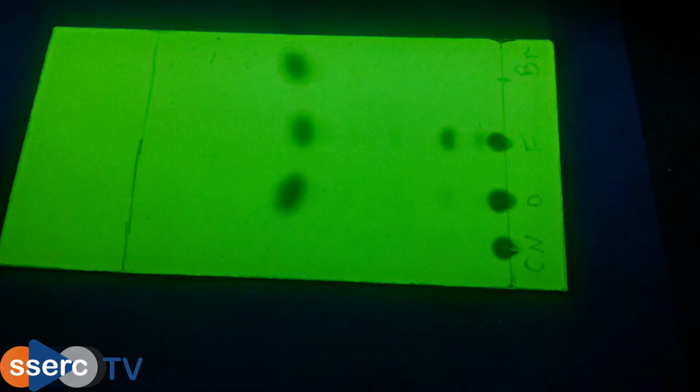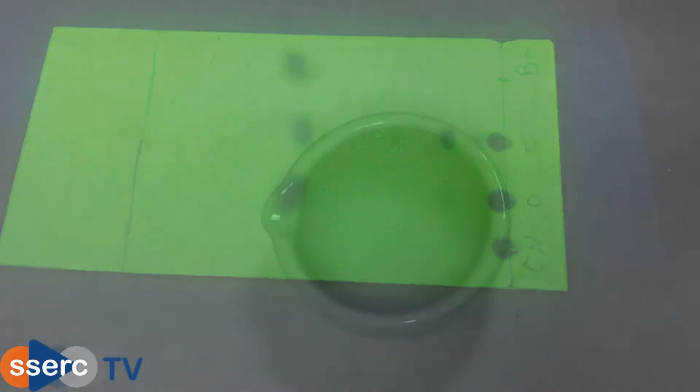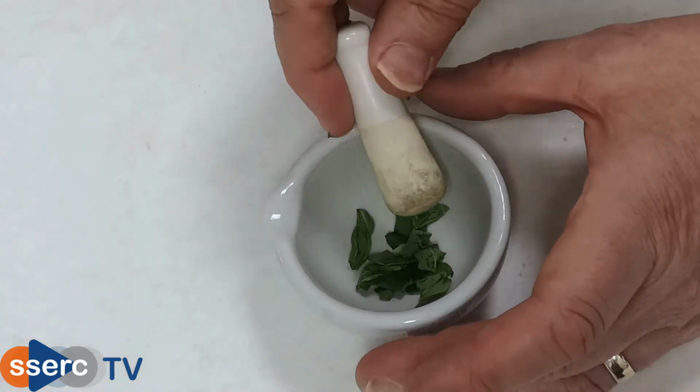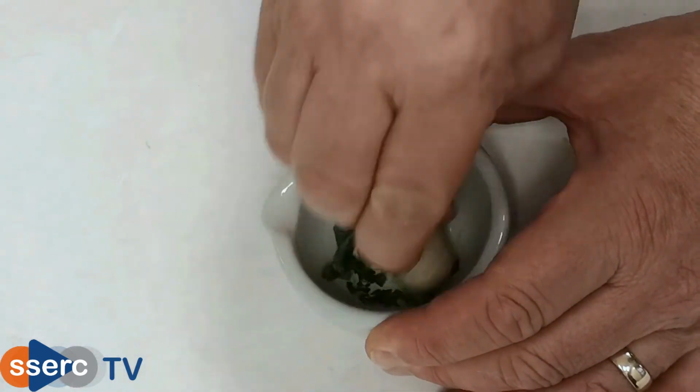Hi everyone, today we're looking at Thin Layer Chromatography, TLC. In particular, we're going to be using it to look at the photosynthetic pigments in basil. The first thing to do is to prepare our plant extract. We're using basil simply because it is easily available all year round and it works well.